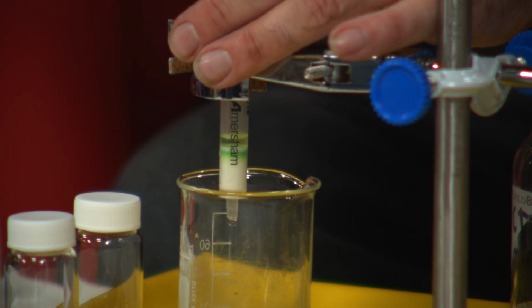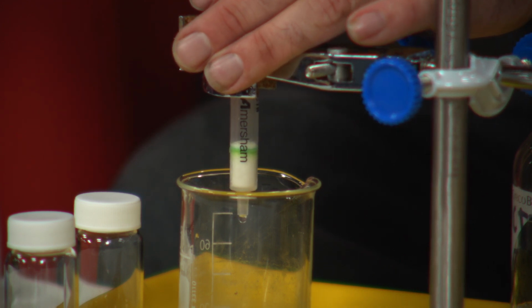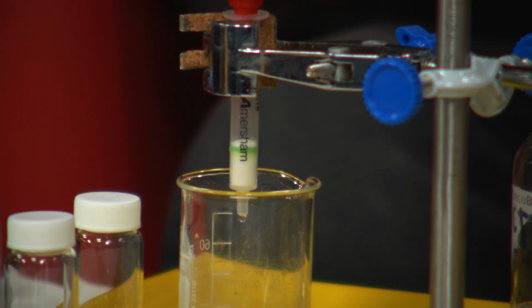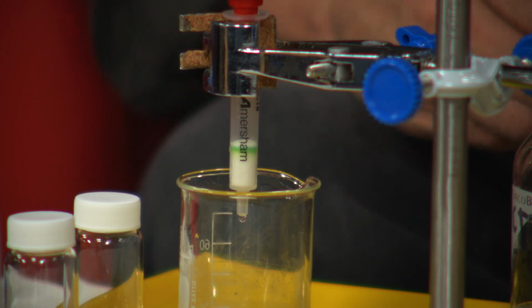And then I guess a good thing if you're demonstrating this, adding more air might be difficult for students to do at home, but it's an important part of the process, just to push the stuff through, essentially. Although that's what's going to be pushing against the solution, pushing it onto the solid material. So hopefully you can now see you've got a material that's packed onto the top of the column, and that's the green stuff.